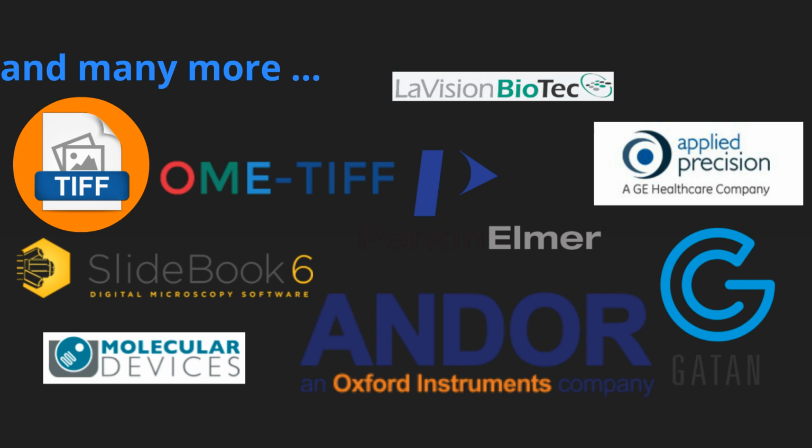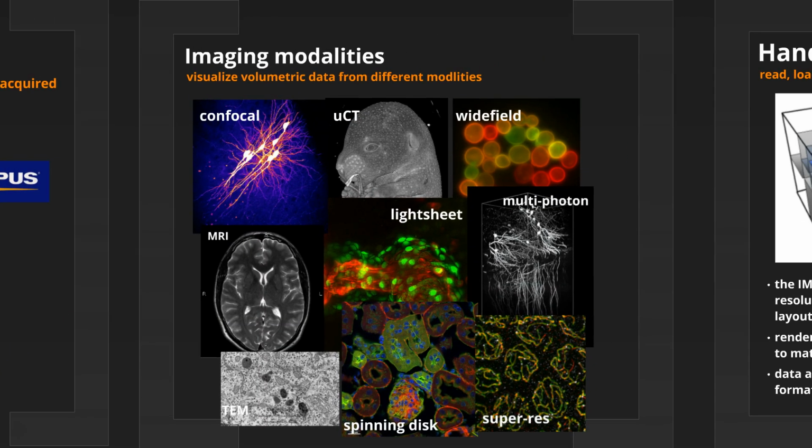Okay, so I want to talk a little bit about imaging modalities. It used to be back in the day that people associated Imaris with confocal imaging. Sorry, I keep blinding myself with the projector. So nowadays, it's a lot more.